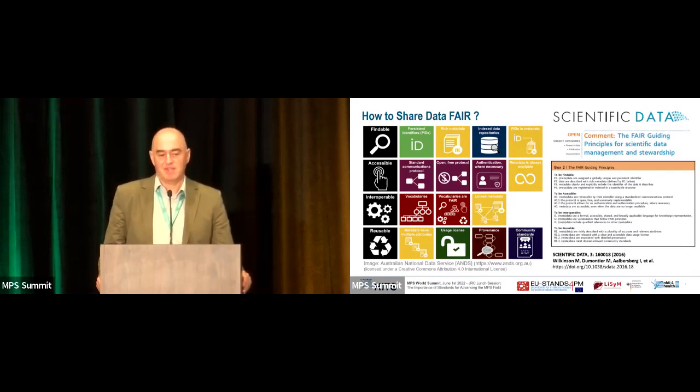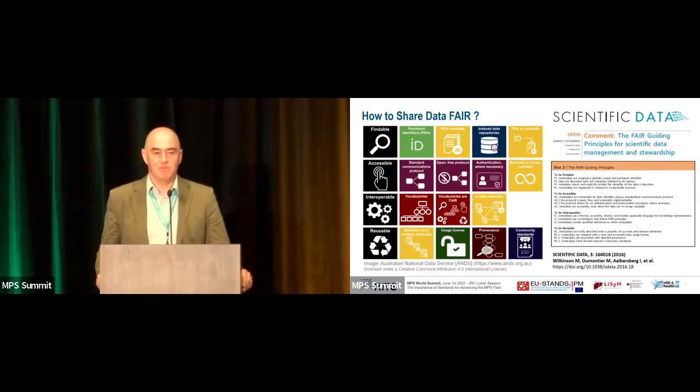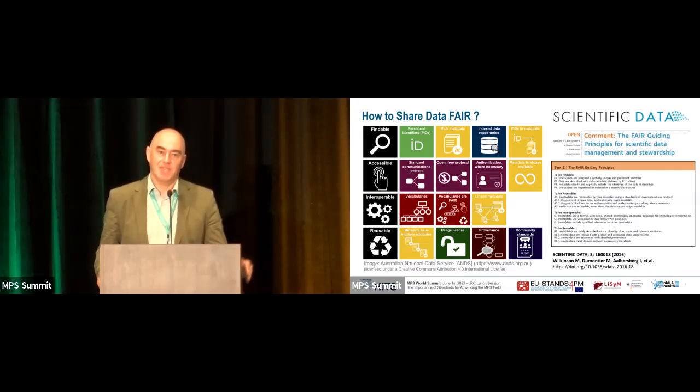And finally, to make the data reusable also, I mean, you want to connect that to other results and you want to integrate that, for example, for the computational modeling, as I mentioned in the beginning. The metadata have to have really multiple attributes, minimum information catalogs of the attributes describe a minimum set of metadata that needs to be there for a certain data type. And also the data provenance, I already mentioned that is really relevant.